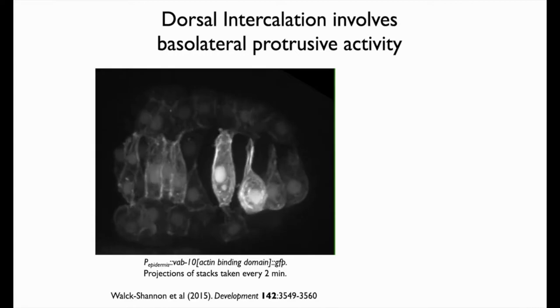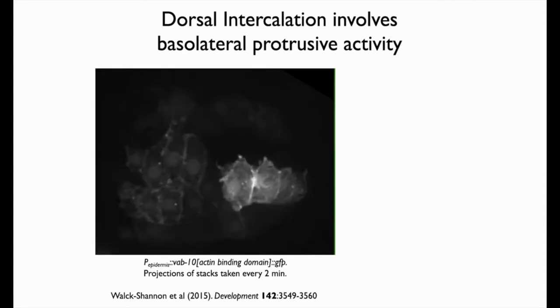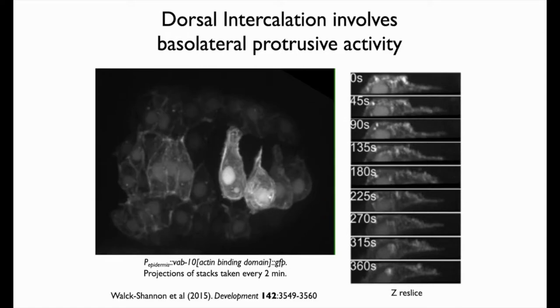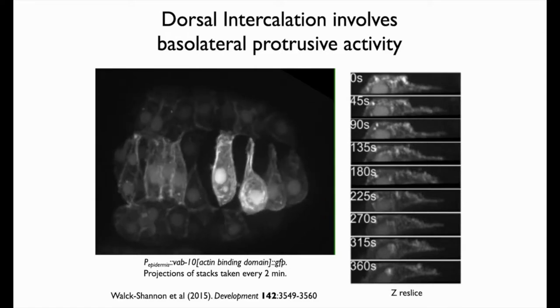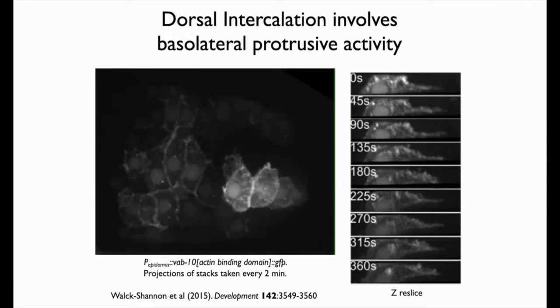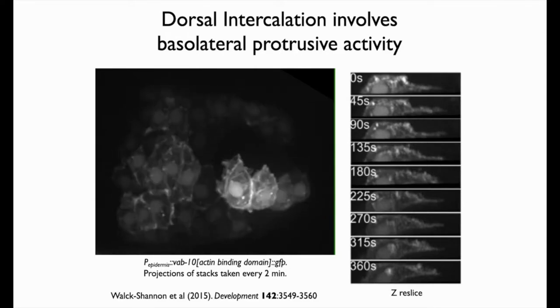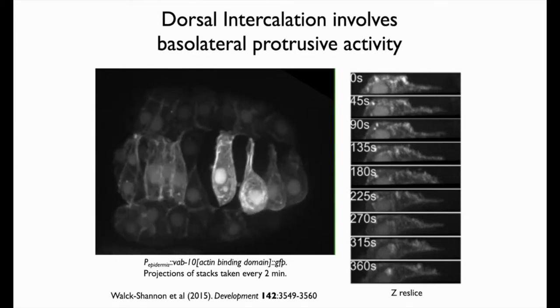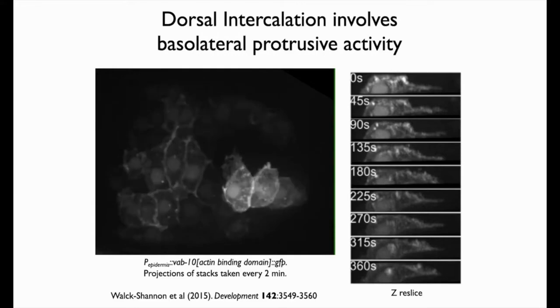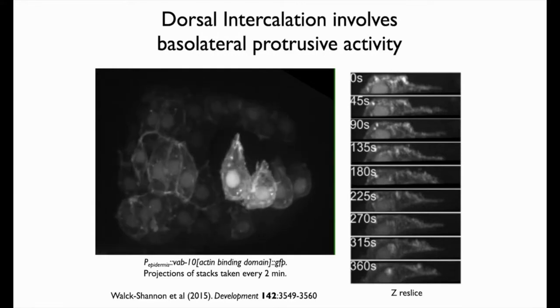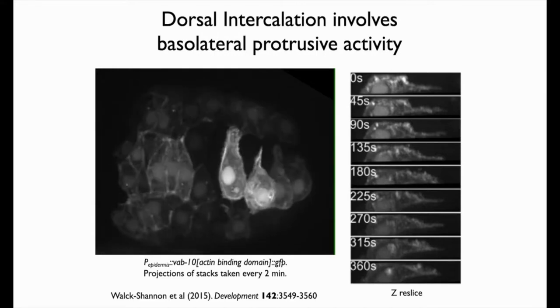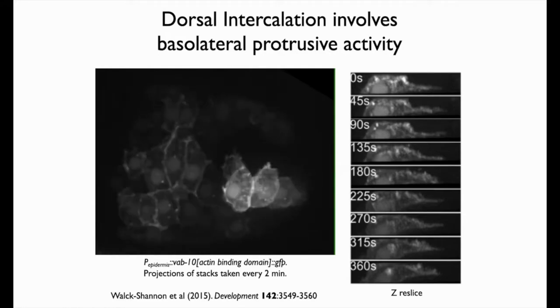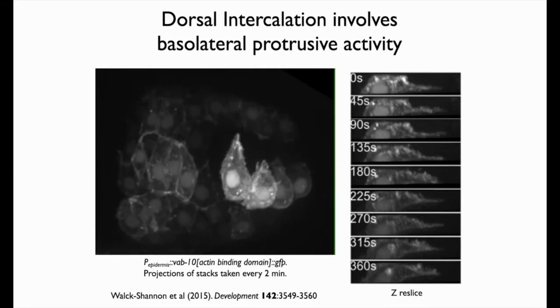Elise also made a Z reconstruction through the thickness of these cells. You can see the nucleus on the left and the cells migrating towards the right, with very thin, highly oriented protrusions as they migrate.